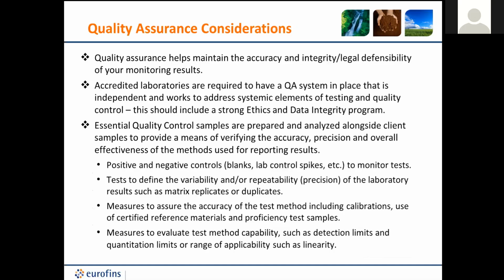Great, thank you. There's another question that came in. Sure. I have heard that labs can upload IGP data right into the ad hocs on Smarts. Is that true, and is that something that you do? Okay. So yeah, we can generate what's called a data deliverable, or an EDD. It's electronic data deliverable. We can provide that to you, and that is uploadable to Smarts.